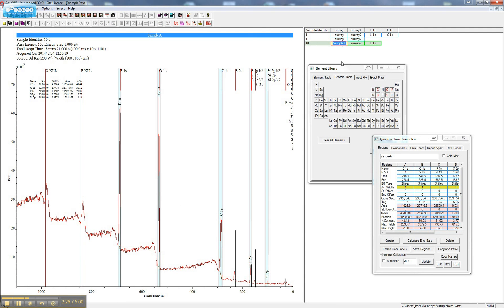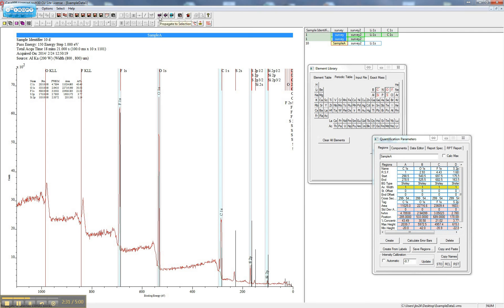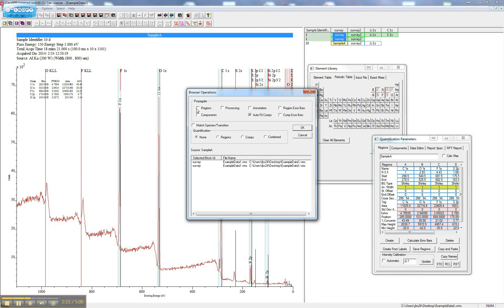You can also propagate this analysis to other similar blocks by highlighting the other blocks, clicking Propagate to Selection, checking Regions and Annotation.